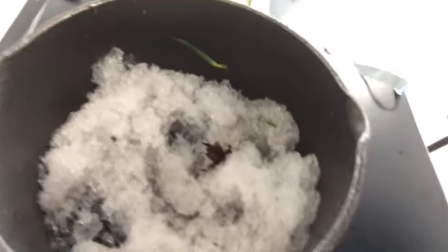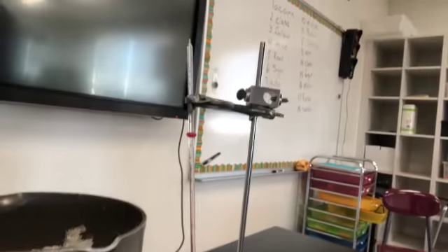But today, if you could see in there, we have snow, which represents a solid, and I'm going to go ahead and put my thermometer in there. Every 5 minutes, we're going to take a temperature and see what happens. I think you guys already know what happens, but there are a couple of things in there that make it very unique that you wouldn't really suspect.